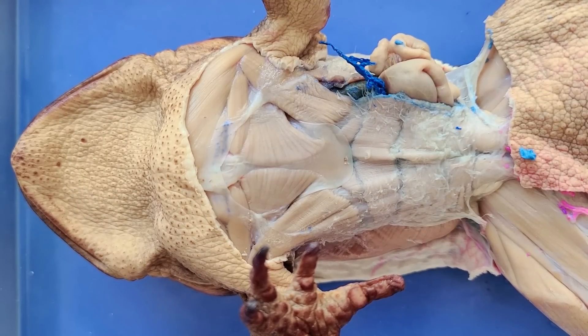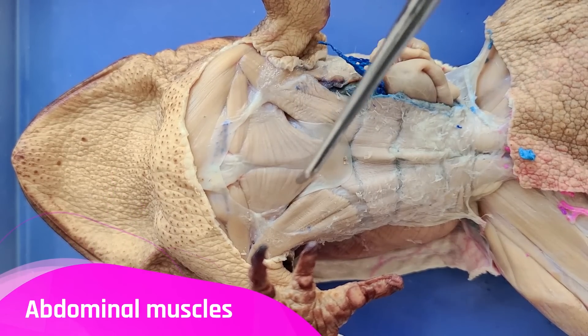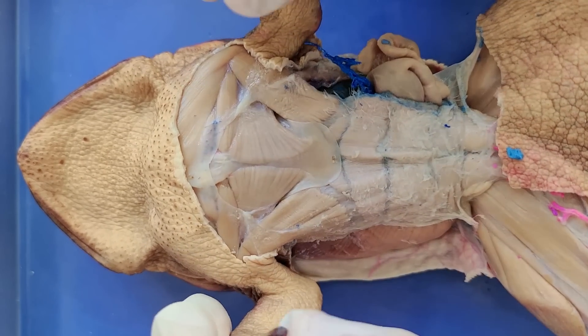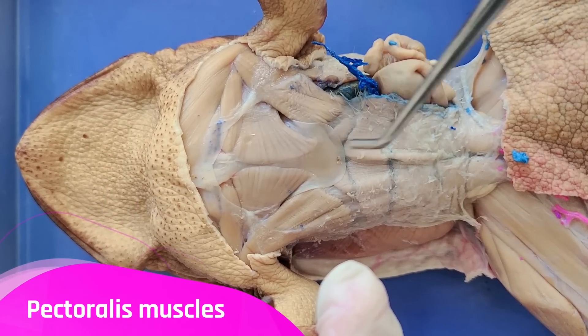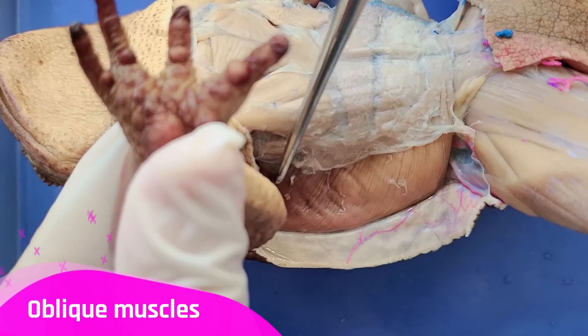So now we can see some of the muscles of the toad. Here are the abdominal muscles, and here are the muscles that move the forelimbs. You can see how the muscles move with the forelimbs. Here are the pectoralis muscles, which are connected to the sternum right here. And here on the sides are the oblique muscles.